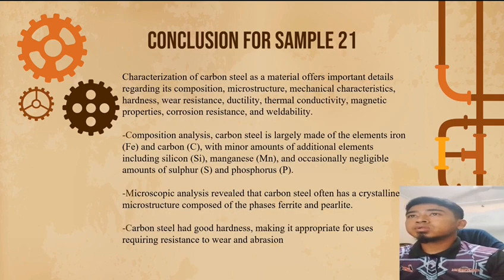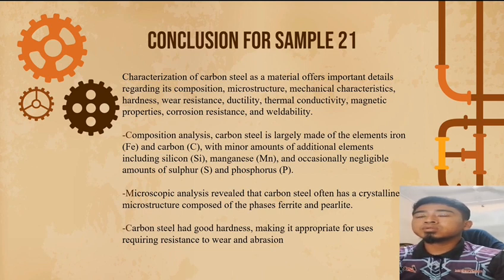For the second sample, sample 21, carbon steel. Characterization of carbon steel material offers important detail regarding composite, microstructure, mechanical characteristic, hardness, wear resistance, ductility, thermal conductivity and magnetic properties, corrosion resistance and weldability.